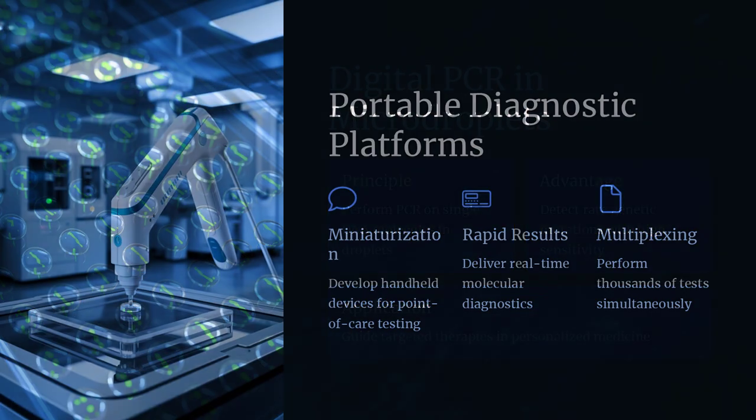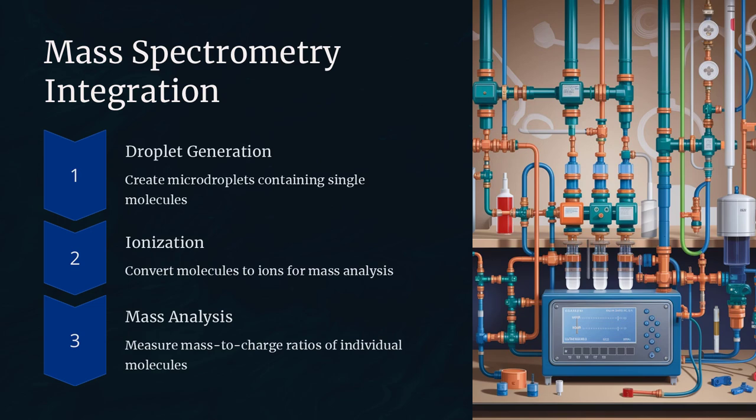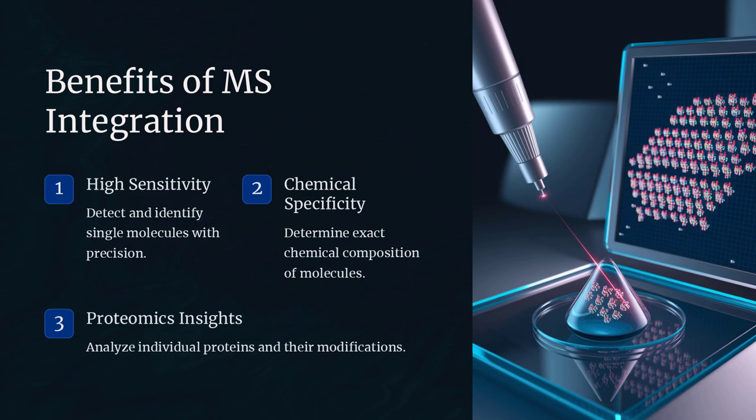The applications of single molecule analysis within microdroplet environments extend across multiple fields. In biophysics, studying individual protein folding events can reveal the mechanisms by which misfolding leads to diseases like Alzheimer's or Parkinson's. In enzymology, measuring the catalytic activity of a single enzyme molecule can provide insights into how enzymes achieve such high efficiencies and how mutations might affect their function. In nanotechnology, the precise control and analysis of single nanoparticles can lead to the development of novel materials with custom-designed properties. Moreover, in clinical diagnostics, single molecule detection methods are being developed for early disease diagnosis by detecting minute quantities of biomarkers, such as circulating tumor DNA or single viral particles, which can be critical for early intervention and treatment.